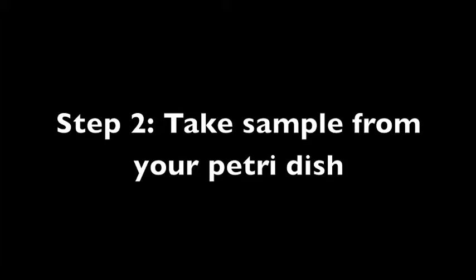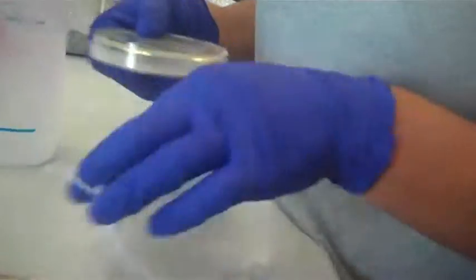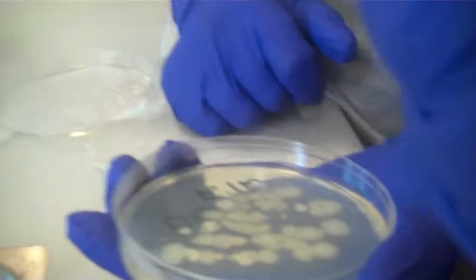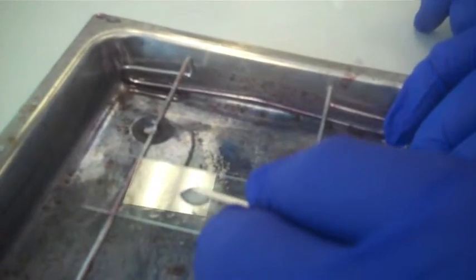Step 2: Take a sample from your petri dish. Rub it into the water until it looks milky white. Then you should dry your sample.